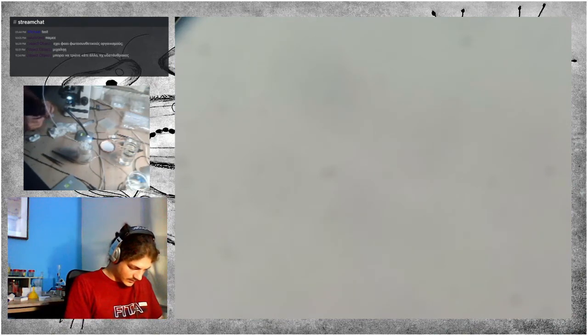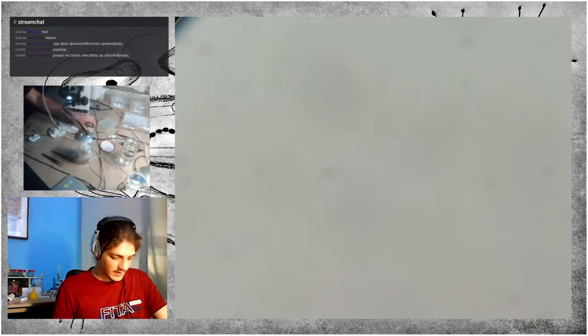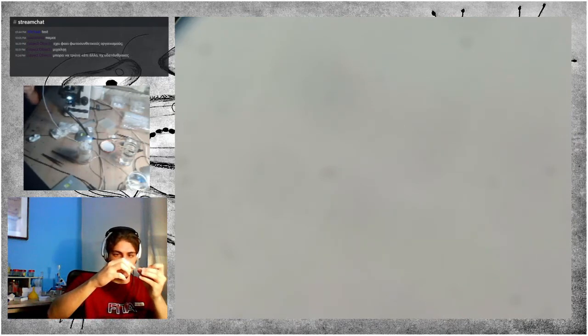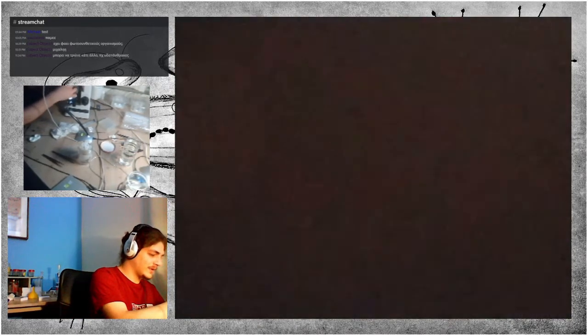Let me find a cleaner one. There we go. Now this slide is very good. It's quite thin. I hope I didn't crush anything though.